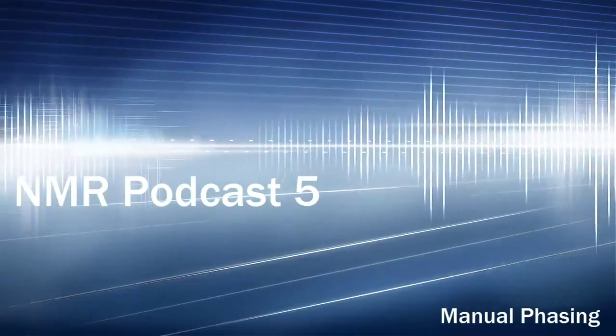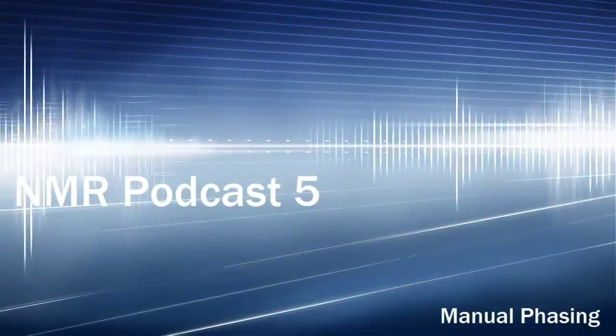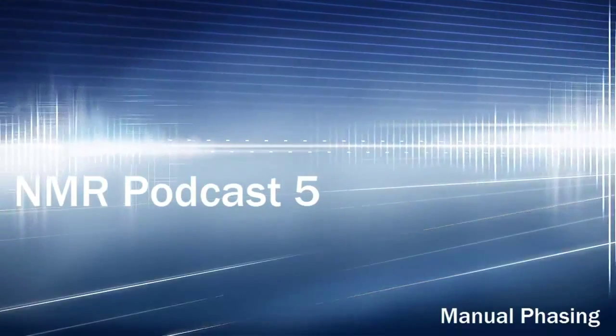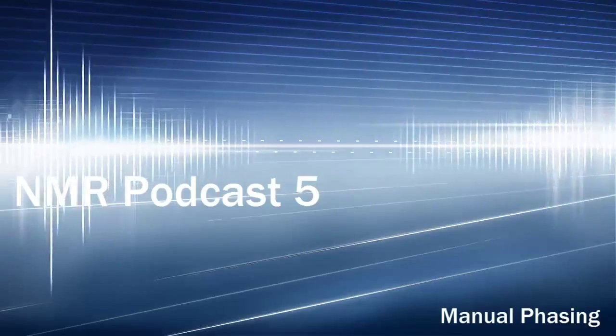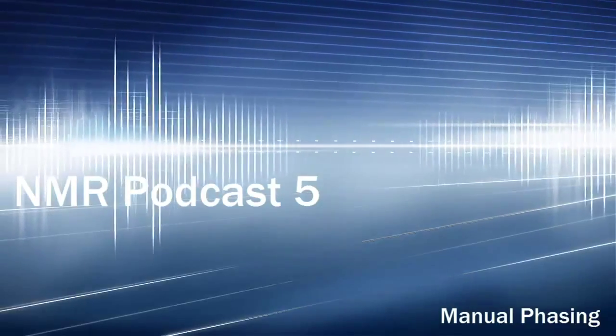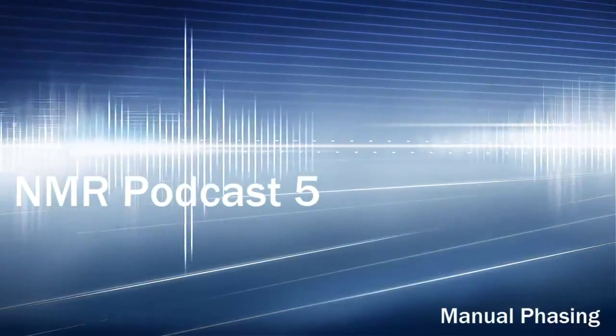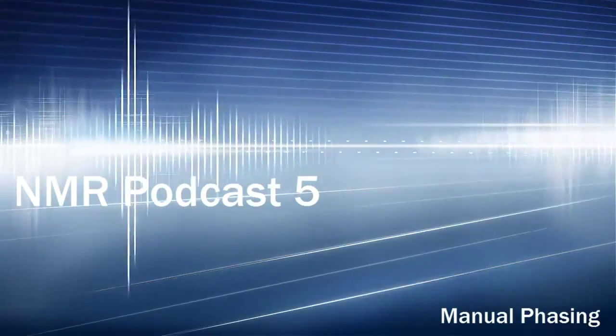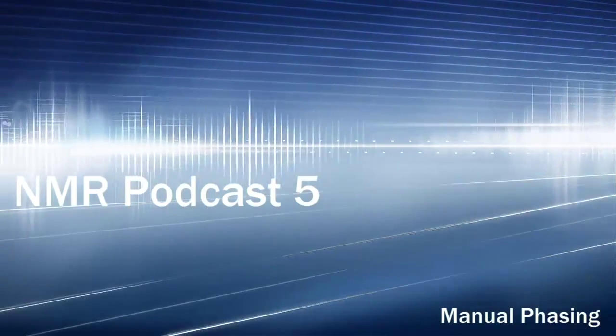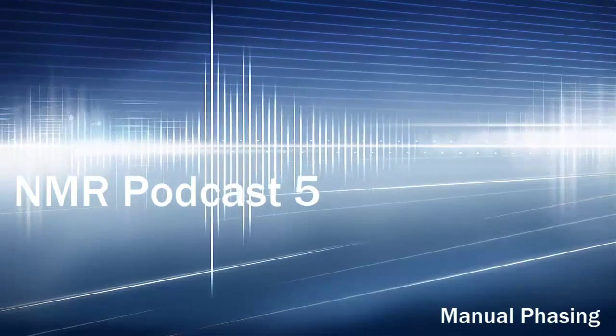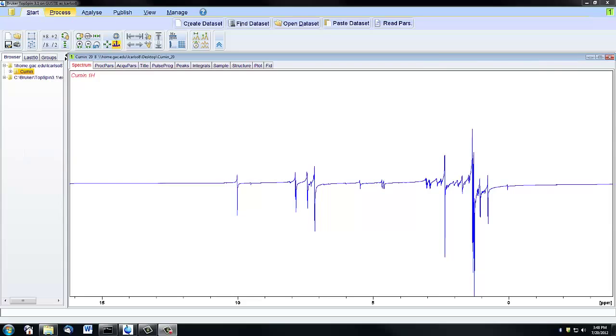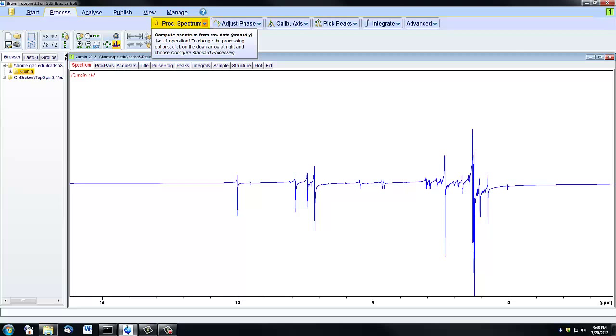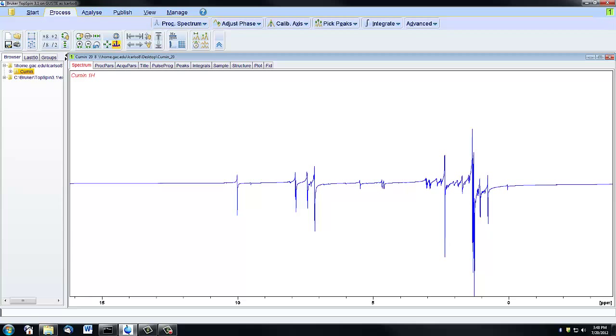This video shows you how to manually adjust your phasing using Topspin. If you watched the third video on basic processing, you will recall that there is a way to automatically phase a spectrum by clicking process and then the process spectrum icon. But it's important to know that there are certain times when automatic phasing won't give you a very straight phase line, and you'll need to do it manually to get proper phasing.